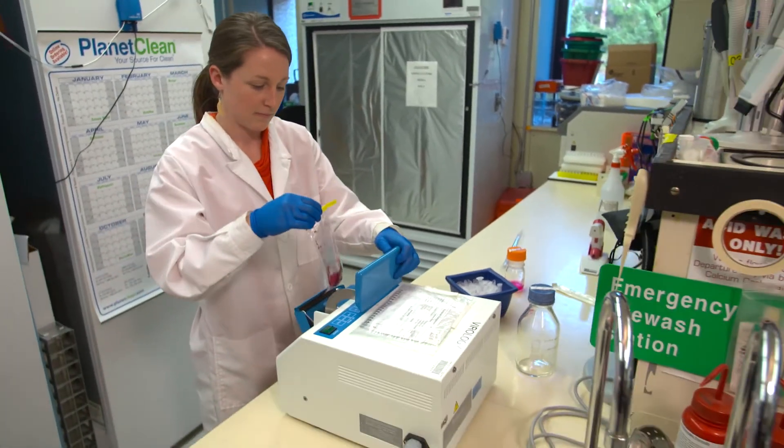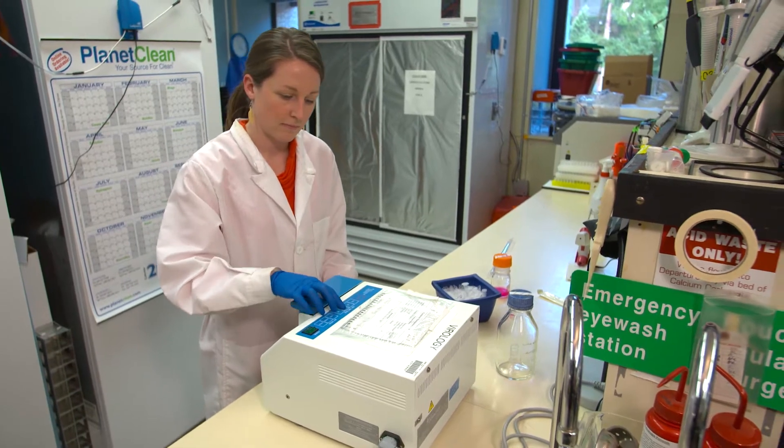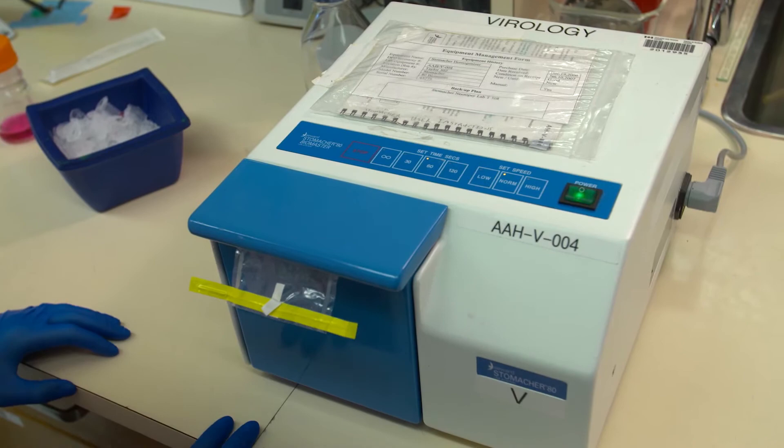Another method to homogenize the samples involves the use of a machine called the stomacher. It breaks up the tissues for further diagnostic testing.